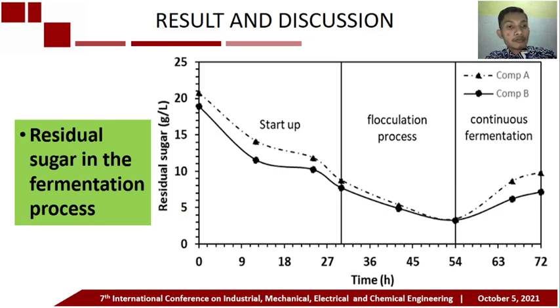Residual sugar in the fermentation process. Profile of residual sugar will be associated with the profile of cell growth. From this graphic, we can know the residual sugar always tends to decrease until 54 hours of fermentation, which is no feeding medium while the consumption is still going on.